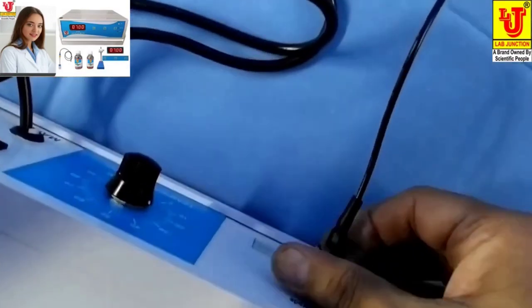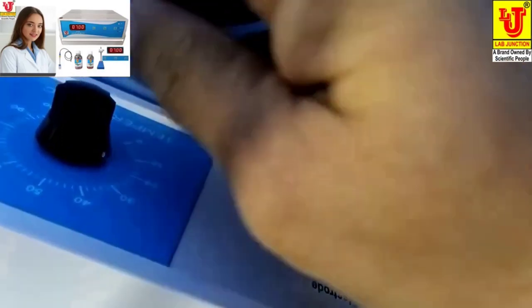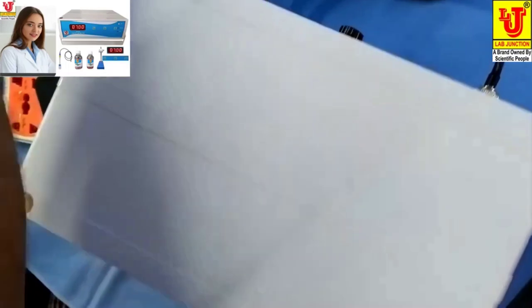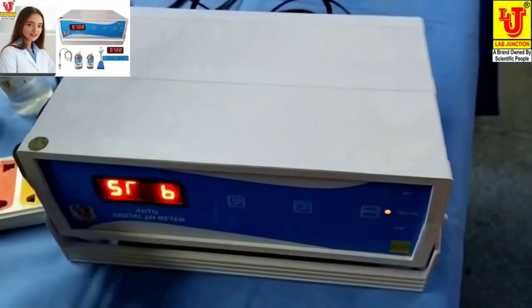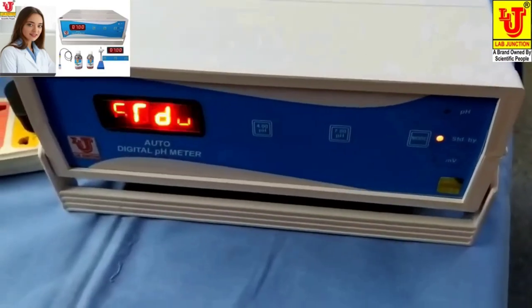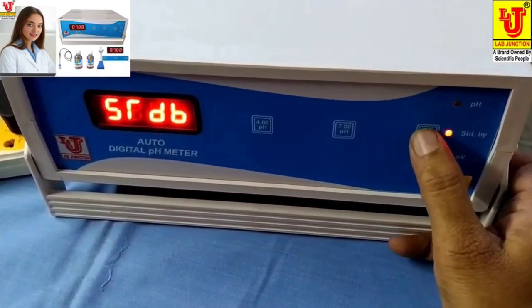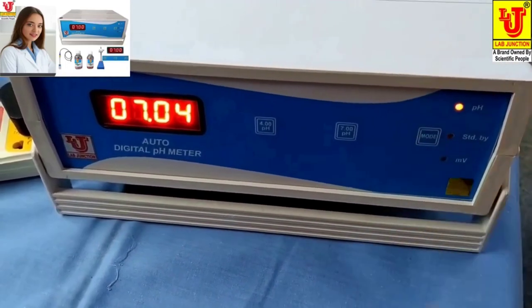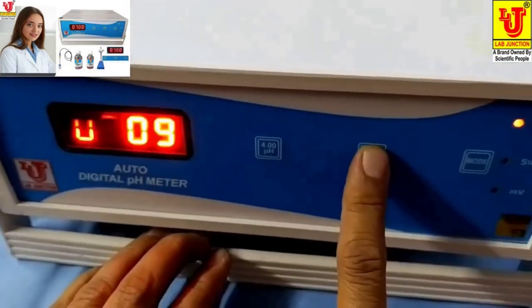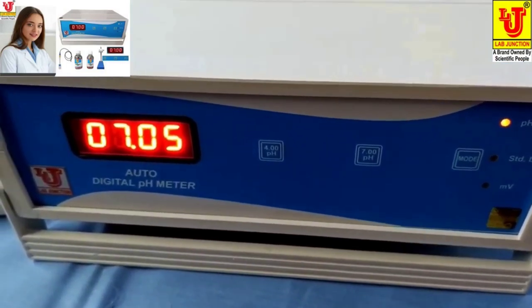First, insert the electrode like this and set it to your temperature at 25. Now switch on the instrument. First, dip this electrode in pH 7. These are the controls: pH 7, pH 4. First it goes to standby, then goes to pH mode.